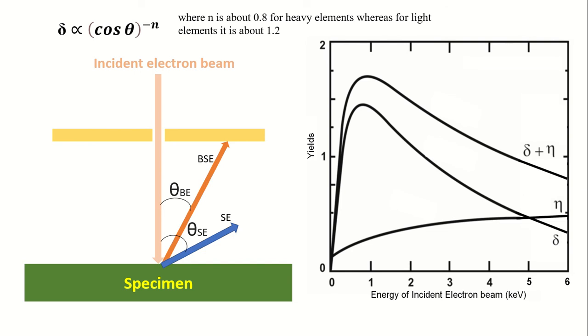But in the case of dielectrics, the concentration of conduction electrons is low, so the possibility of escape of secondary electrons is greater.